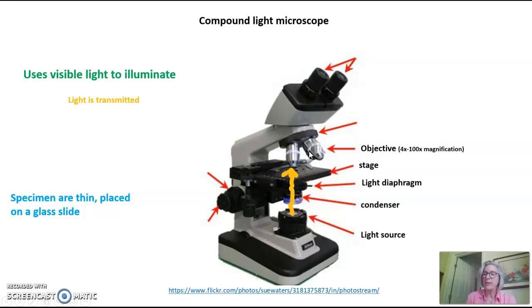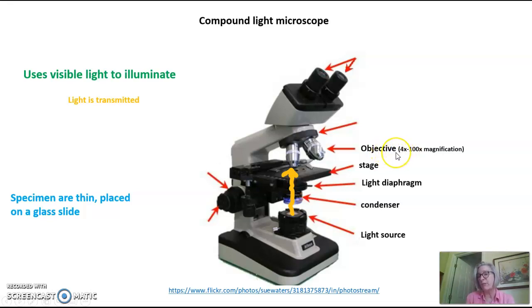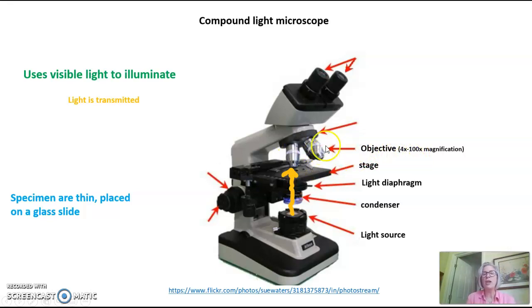There are different objectives that magnify to different levels. An objective can be as low as 4x magnification — and that x is critical, it's the unit of magnification, so you would always call this the 4x objective, never just the 4 objective. You can have a 10x objective or a 100x objective, and you would adjust these depending on what magnification you want to see.